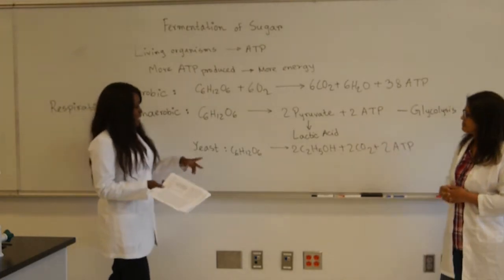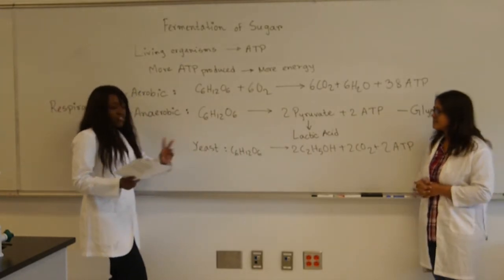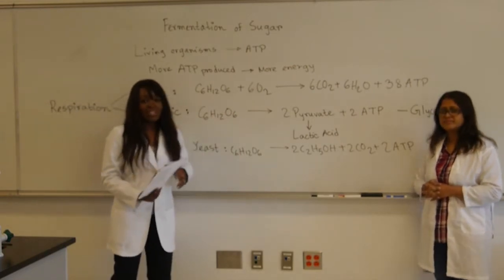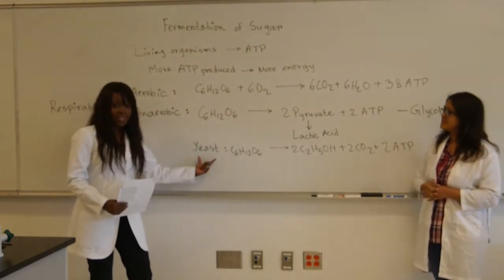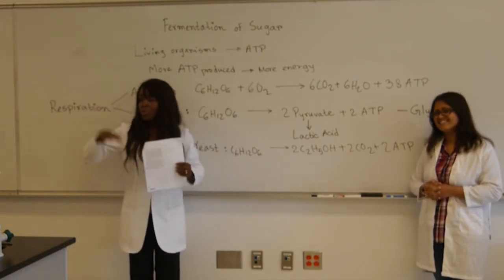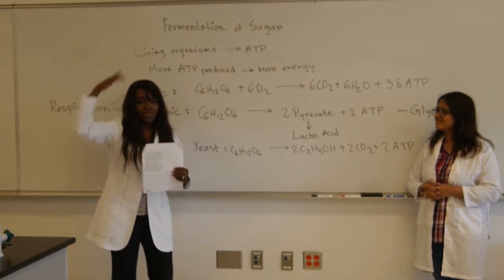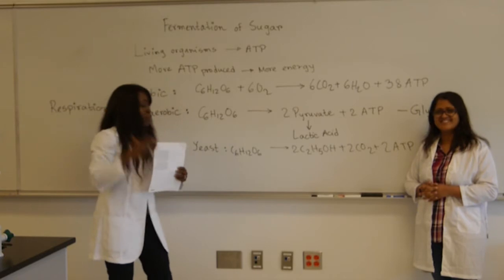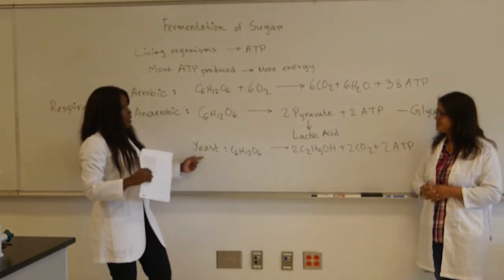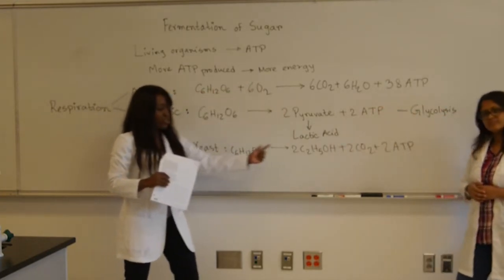One thing I want to add is that since yeast is a living organism, when given a choice, it will actually prefer to go through the aerobic route. Exactly. Now we as scientists are going to force the poor yeast to go the anaerobic route. How are we going to do that? When we put them in the bottle, we'll put oil over their heads. Well, they don't really have heads, but on top of them. Putting oil over them will block any oxygen from coming in. So though they want to go the route that makes 38 ATP, they'll be forced to go this route.